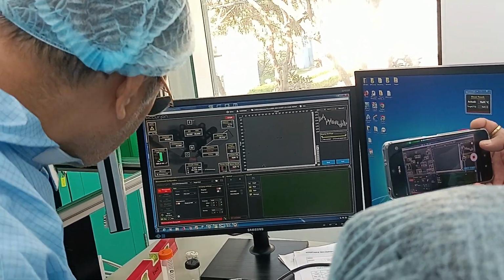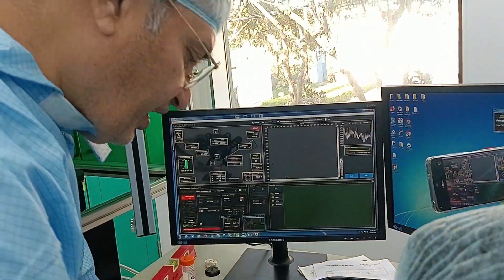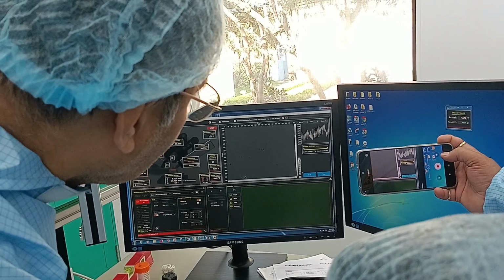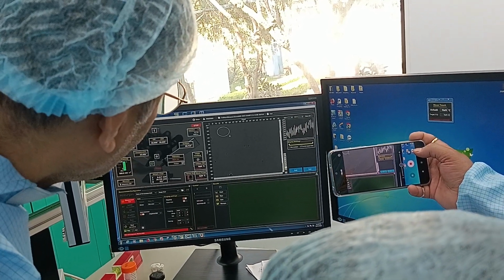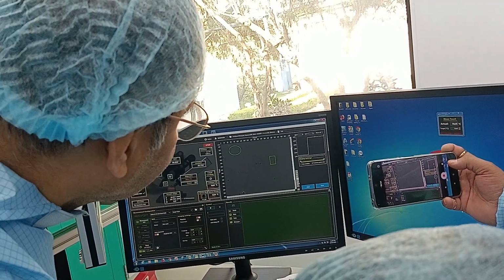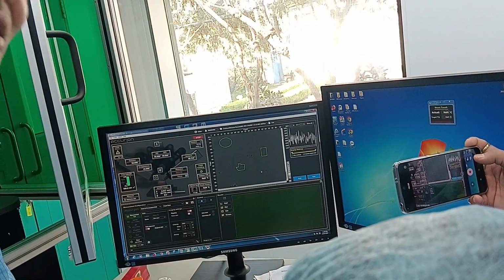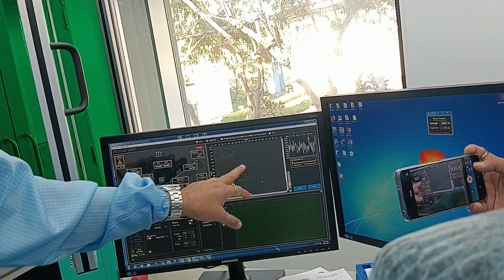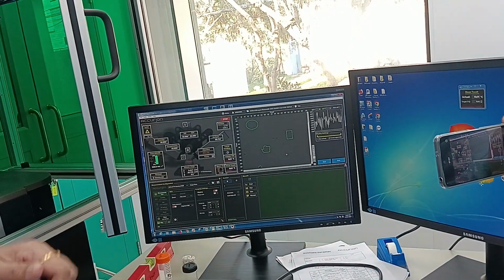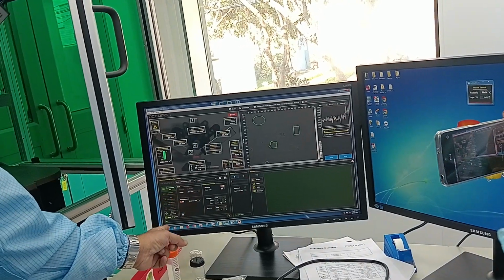The reason is it says auto exposure missing ROI, region of interest is not created. So I have to create a region of interest. So I say okay, go here, any shape you can click. You can click a circle. So I'll do this, or I can do this. Okay. Fine. So this is 3 regions of interest, that is 0, 1, 2. 3 regions of interest I can evaluate. Then now you see everything has become green.